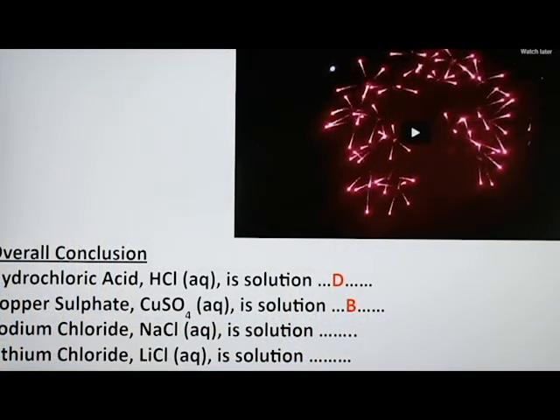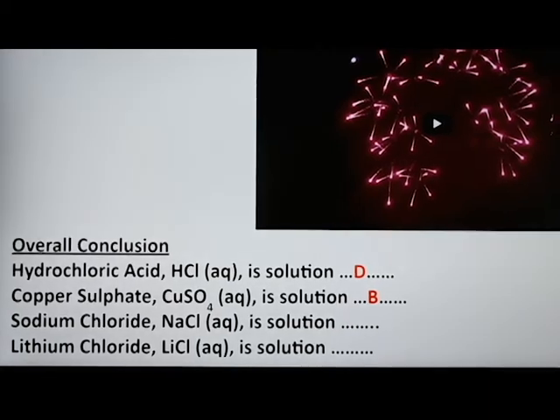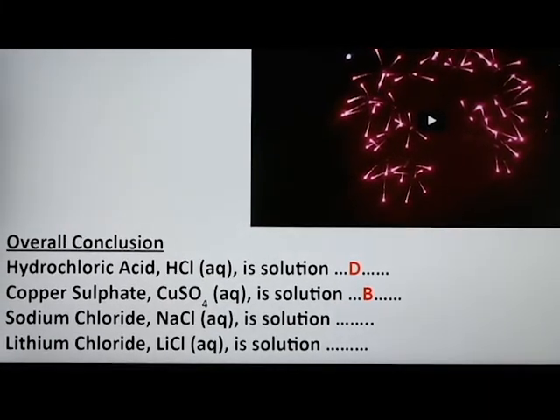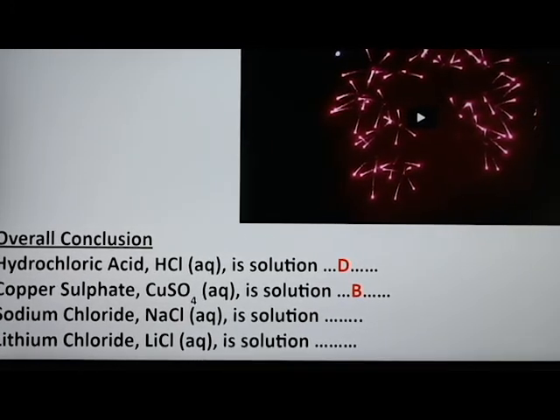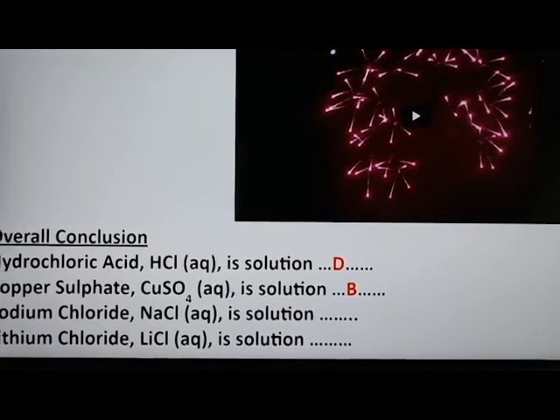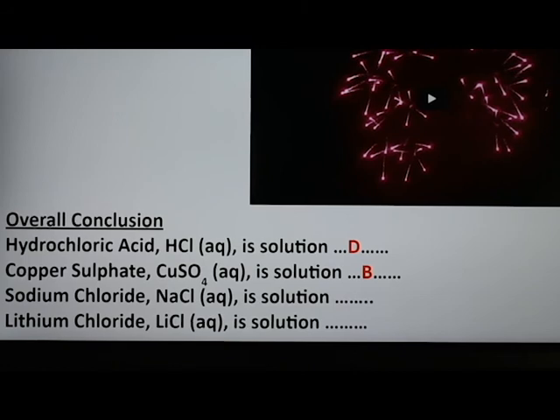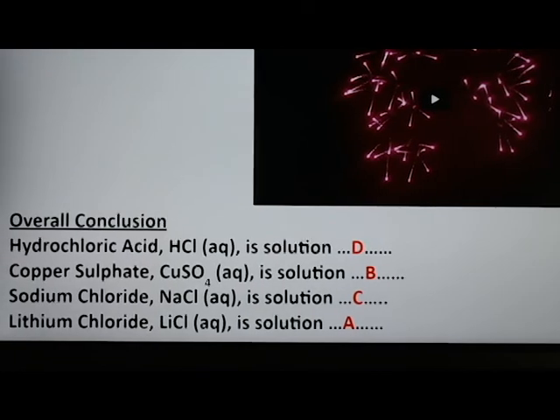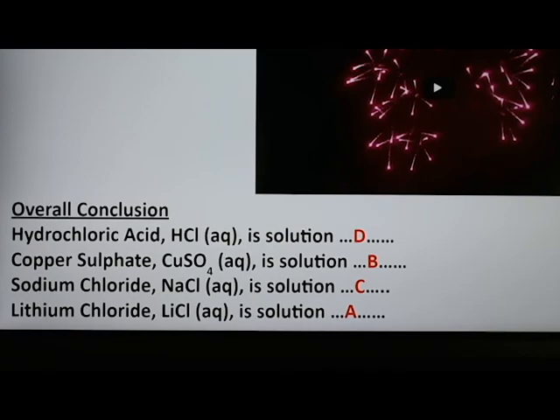So we already knew that hydrochloric acid was solution D and that copper sulfate was solution B. The flame tests allowed us to distinguish between sodium chloride and lithium chloride. Remember, lithium chloride is used to give the red colour in fireworks. So decide which solution is sodium chloride, which solution is lithium chloride. And hopefully you've chosen C for sodium chloride and A for lithium chloride.